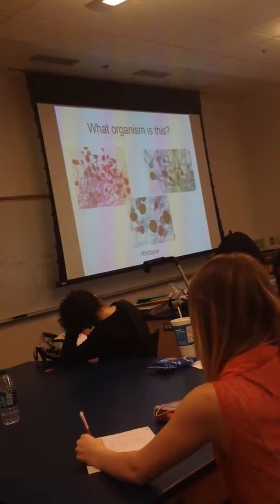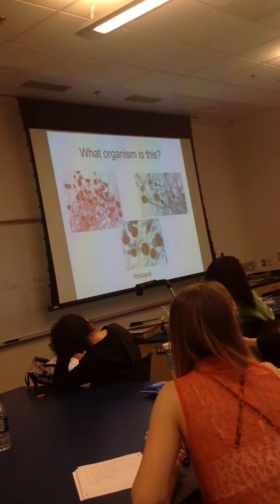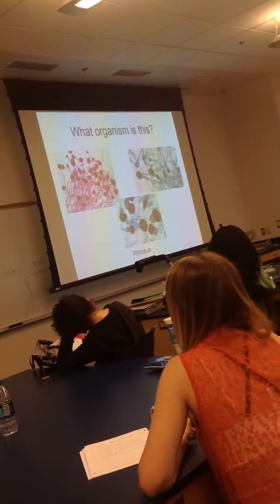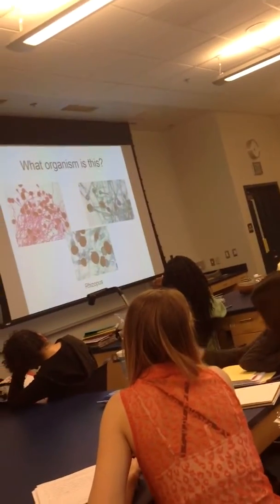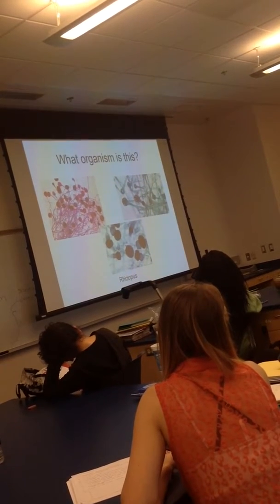So it's rhizopus. You have to know the name is rhizopus, okay? That's what we called it in lab, but it is the black bread mold. Did I say black mold? I'm sorry, yeah, black bread. Black bread mold. Okay? It's also the one that you had in that little test tube on the microscope. But this is the slide version of it. Okay, so this is rhizopus.